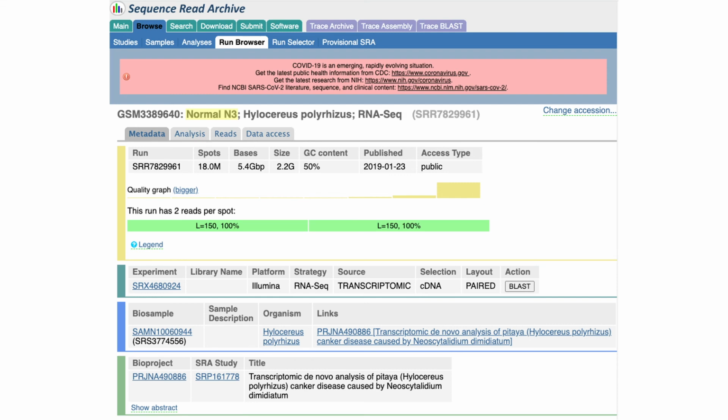As my advisor says, every transcriptome is a metatranscriptome. The takeaway from this example is that we should practice caution when using SRA datasets. Labels may not represent the data.